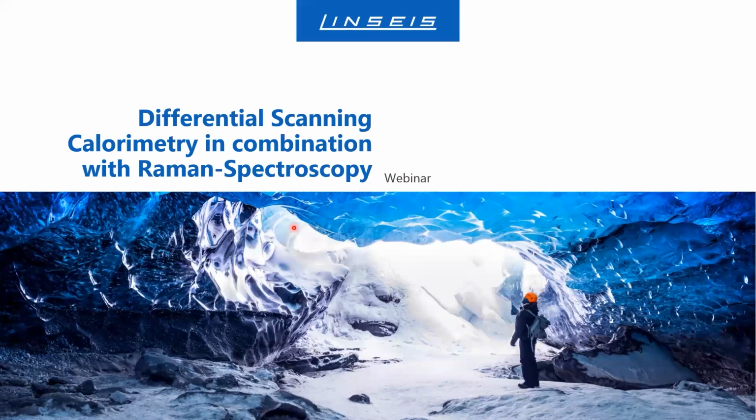First of all, today we want to talk about differential scanning calorimetry in combination with Raman spectroscopy.